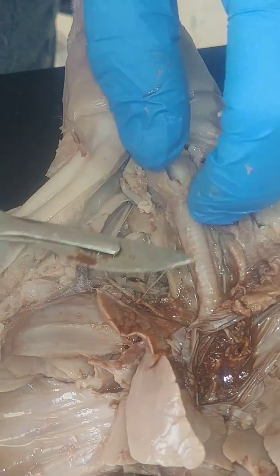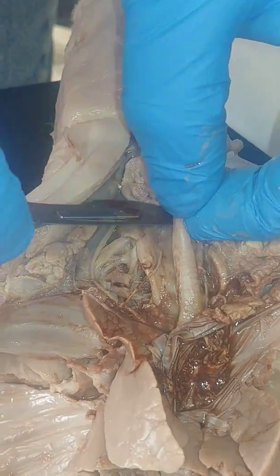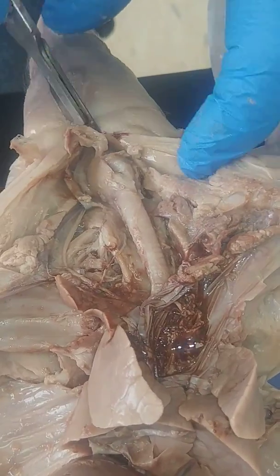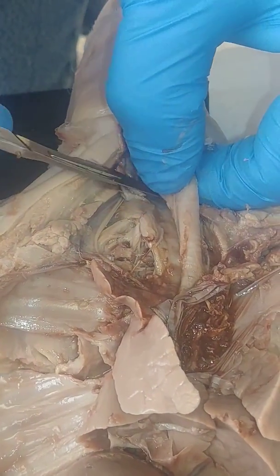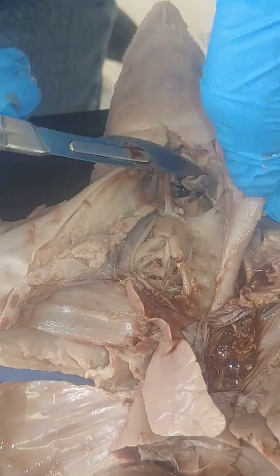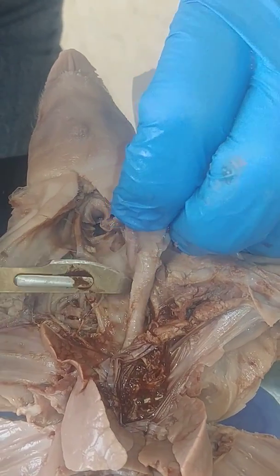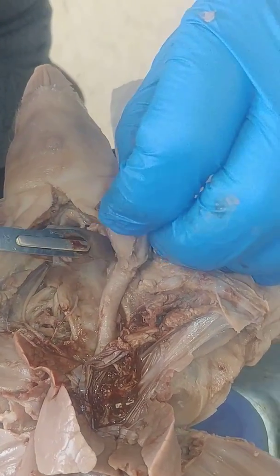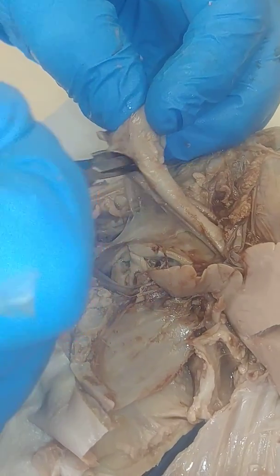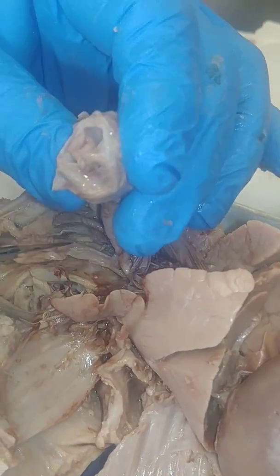And if we can remove this, we might be able to get a look at the inside. And if you notice, there's another little tube right underneath it. And that tube that I'm separating right there, that's the esophagus. So food would travel down the back side.